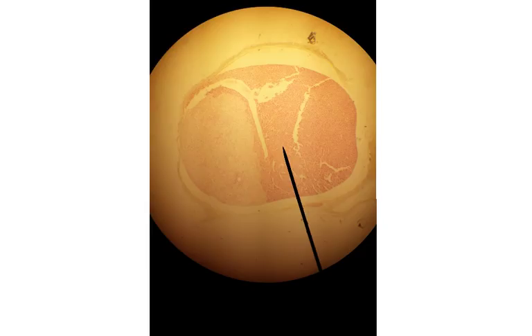Now we've moved to the pituitary gland. This is actually kind of a unique gland in that it's two separate structures derived from two completely different tissue types. We can see, looking at it, that the two areas visually look quite different. This lighter area here is the posterior pituitary, also called the neurohypophysis. The hypophysis is just another name for pituitary. The neurohypophysis, or posterior pituitary, is actually neural tissue. It's nervous tissue that comes down from the hypothalamus.